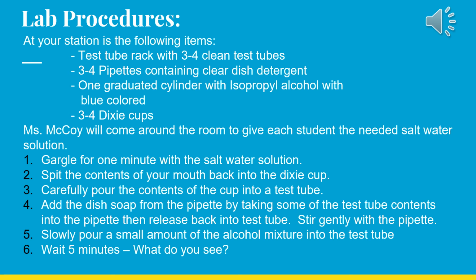Step 5. Slowly pour a small amount of alcohol mixture into the test tube. Step 6. Wait 5 minutes. What do you see?